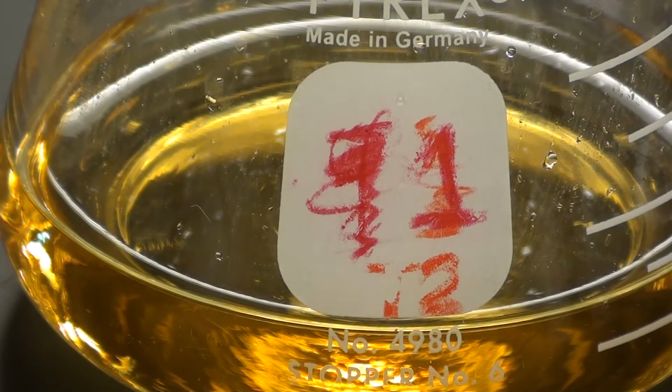So I'm going to sit here and wait for this to change colour. It starts out as a yellow because it's iodine, and iodine is a brownish colour, and then when it becomes diluted it sort of turns into a yellow. As the reaction occurs, the iodine disappears because it's the limiting reagent, everything else is in excess. And it turns from a yellow colour to a colourless colour. It's a fairly quick change in that you get to see the difference between the yellow and the colourless.